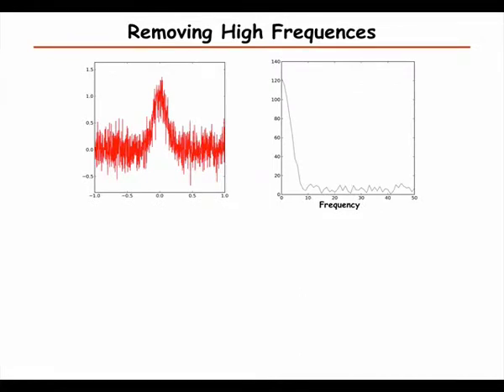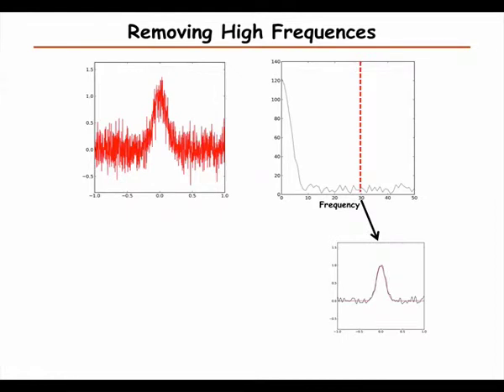So now, as we did before, we can remove higher frequencies. If we, for example, decide to cut all the frequencies that are, in this case, above 30, the black curve here shows what we get after that filtering, and the red is the original Gaussian without noise.